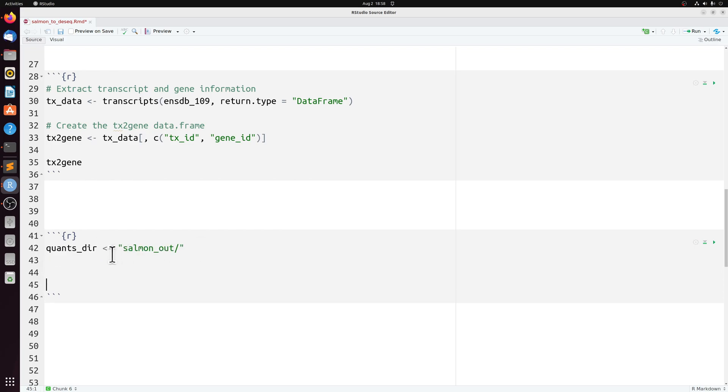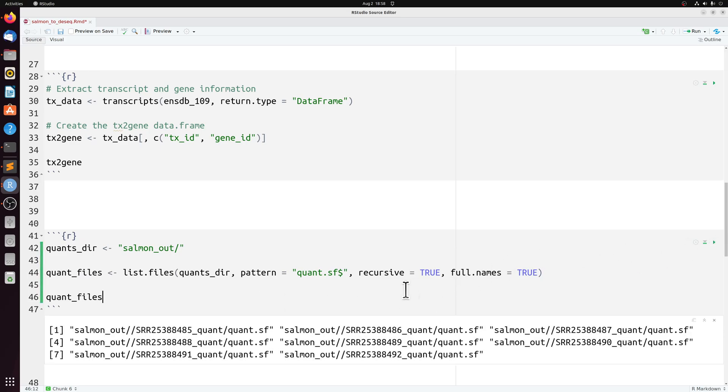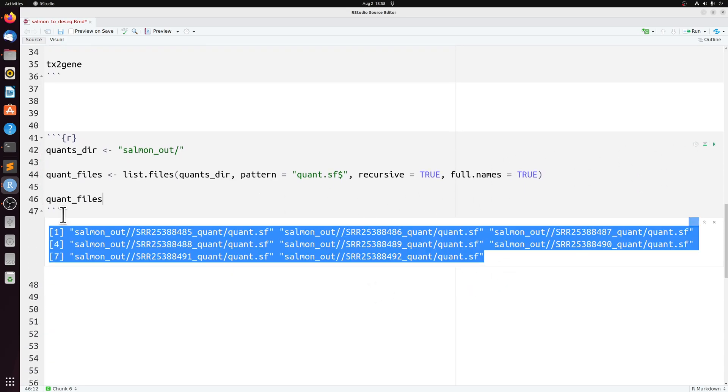I put all my salmon output into the salmon out parent directory. And then I can get the path to all those files with list files here, just matching quant.sf. So if we look at that, here are the eight paths to our quant files.